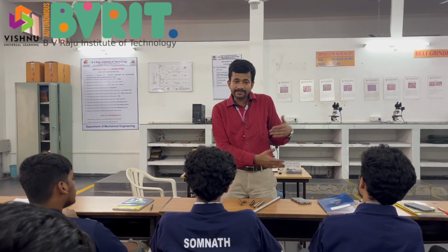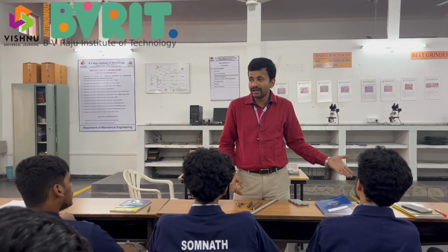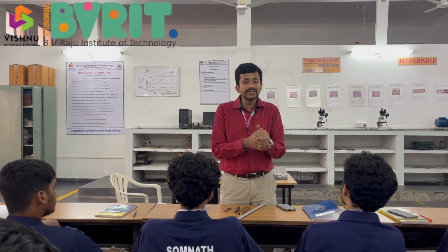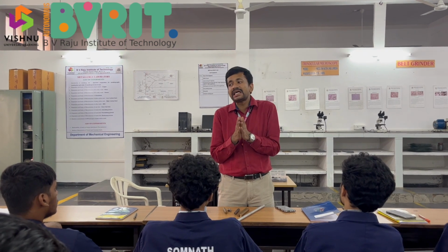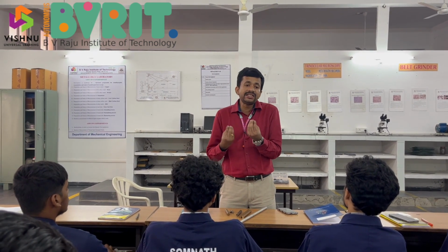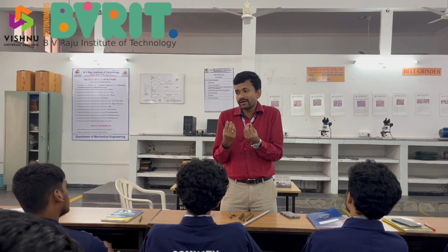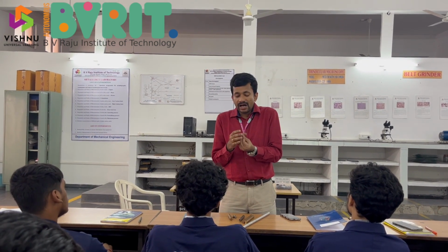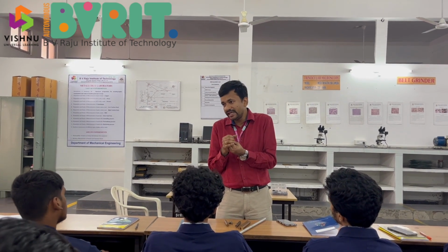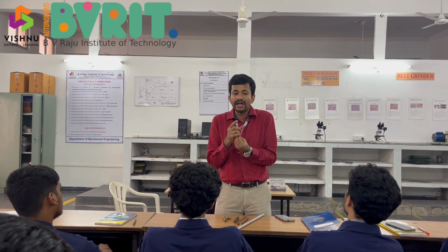This we will explain in depth in the classroom, but here what I am going to say is, what are grains? Grains are nothing but alike arranged elements, or all the crystal structures which are alike combine to form one grain.